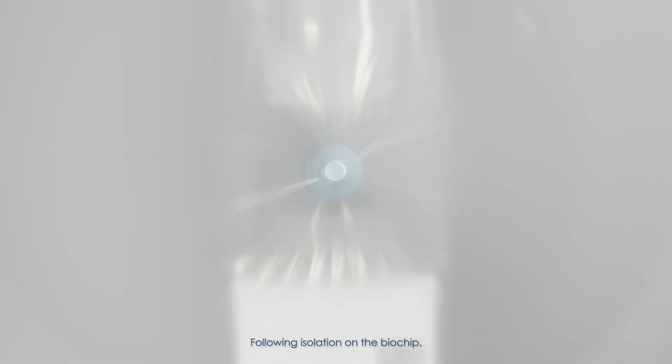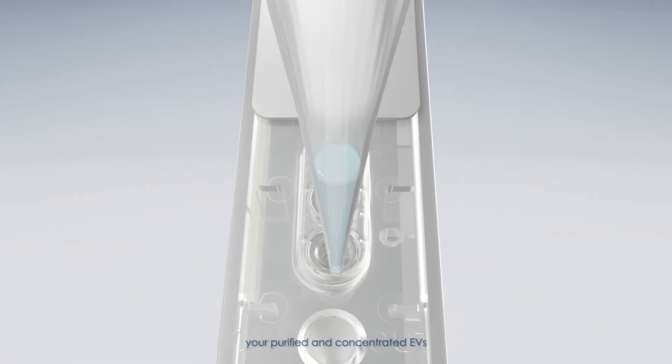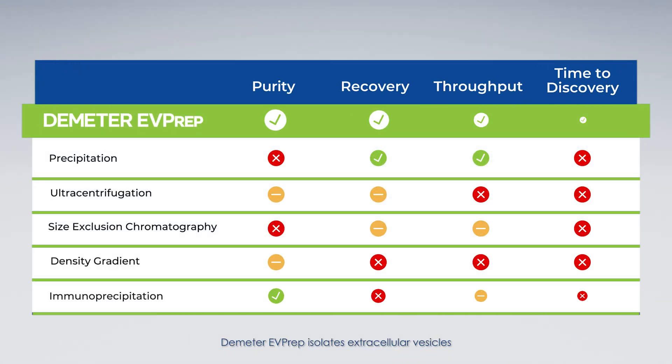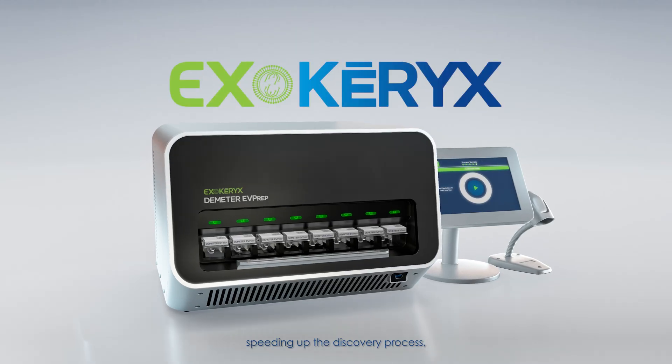Following isolation on the biochip, your purified and concentrated EVs are eluted and ready for use in your downstream testing. Demeter EVPREP isolates extracellular vesicles with higher purity and higher recovery than other methods, speeding up the discovery process, saving you time and money.